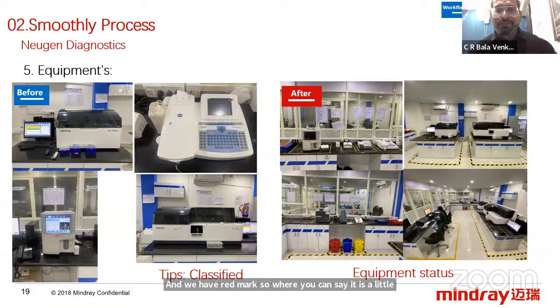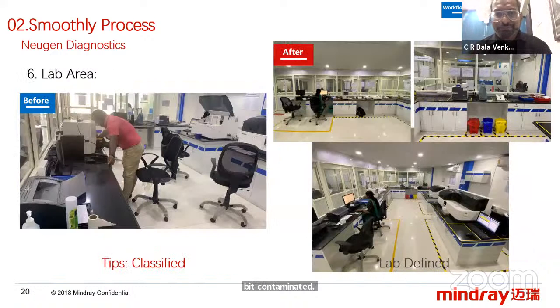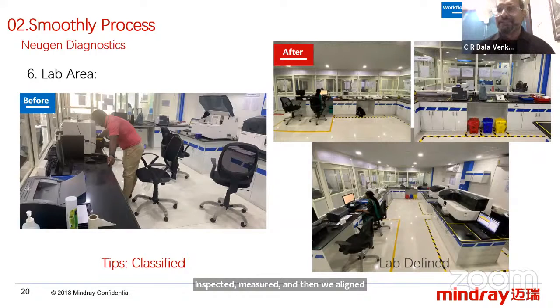And you can see this is how we inspected, measured, and then we aligned the machines according to the process. So we initiated the samples. Then we have this sample area also, made it very easy. Made one divider for the sample to come from the sample area to the laboratory. So we made it very simple for them, rather than traveling to another place.